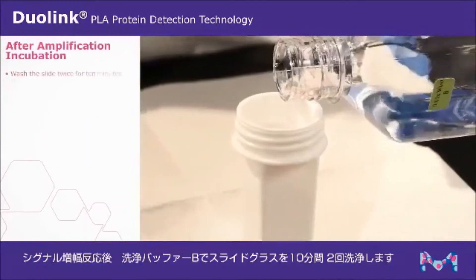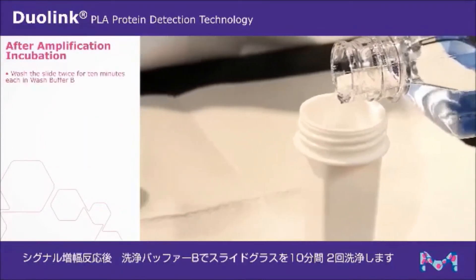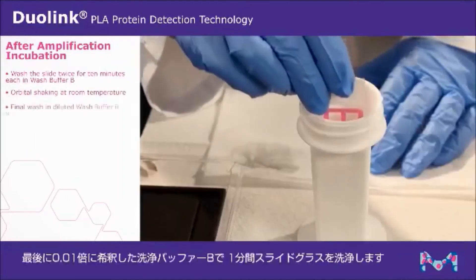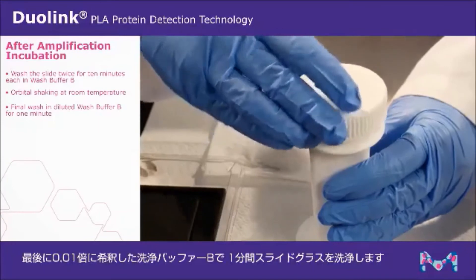After amplification incubation, wash twice using wash buffer B for 10 minutes each with gentle orbital shaking at room temperature. Then perform a final wash in diluted wash buffer B for one minute.